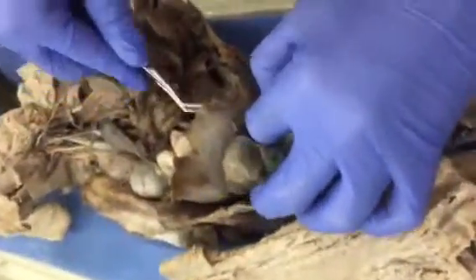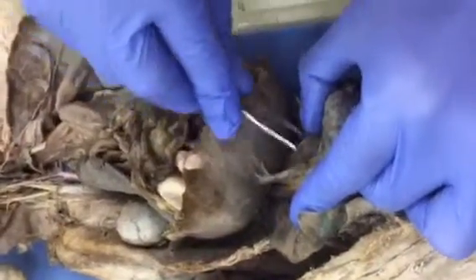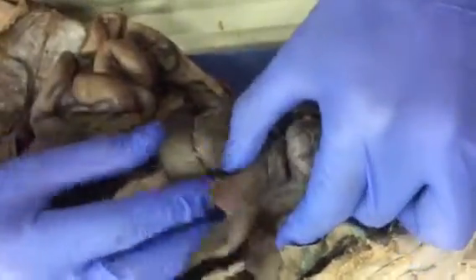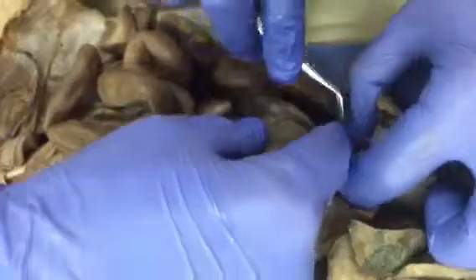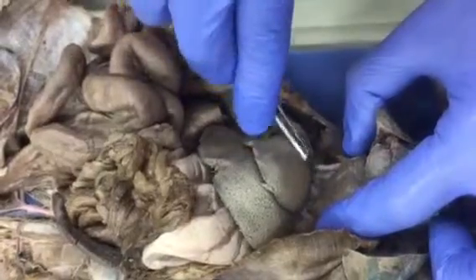So this is your diaphragm, right? This is the falciform and the round ligament. I think those are between the diaphragm and the liver. The round ligament is basically just a vestigial umbilical cord, the remnants of it.